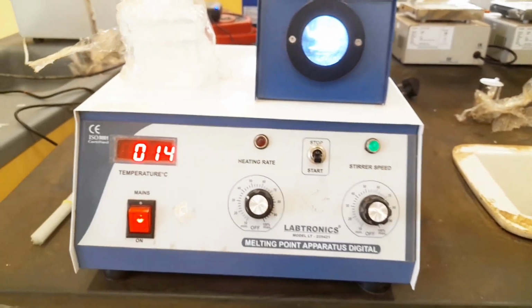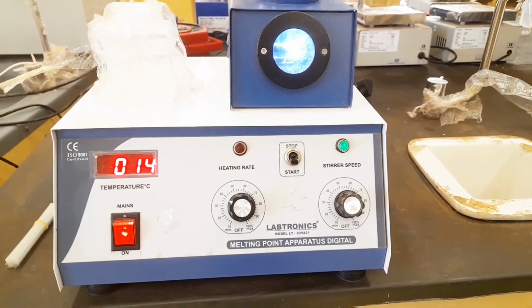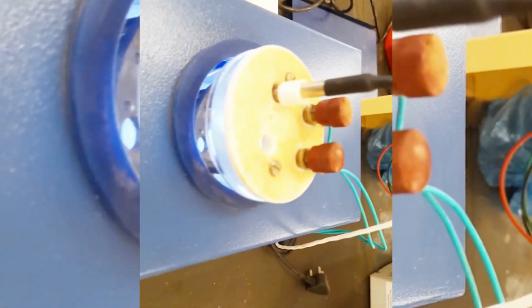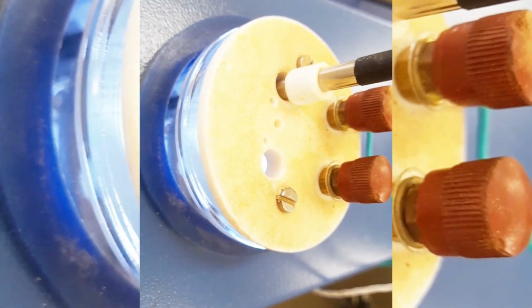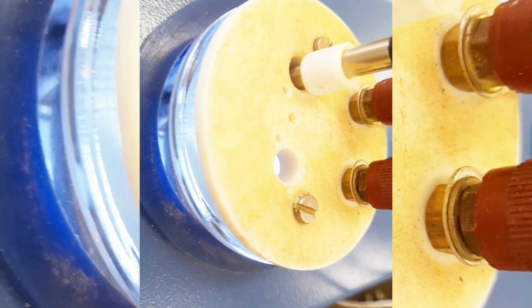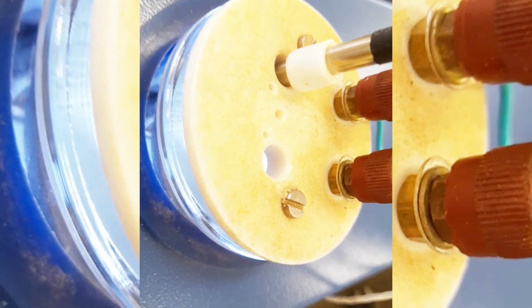If you want to measure the sample, we can keep the sample and measure the exact melting point of the crystalline compound. You can see here there is a big hole which is left empty. In that there is a separately arranged tube. From that we can insert liquid samples also, where we can measure the boiling points.